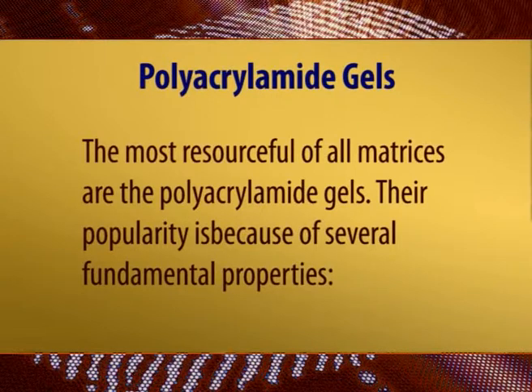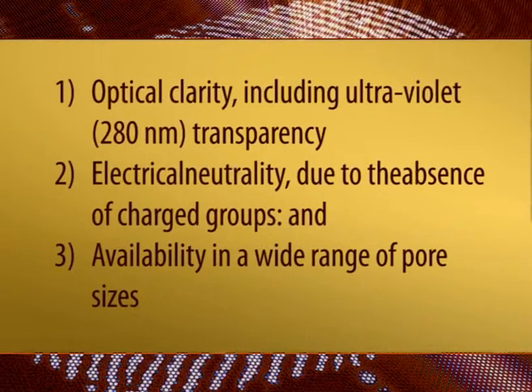Polyacrylamide gels. The most resourceful of all matrices are the polyacrylamide gels. Their popularity is because of several fundamental properties: optical clarity, including into the ultraviolet range, the absence of charged groups, and availability in a wide range of pore sizes.